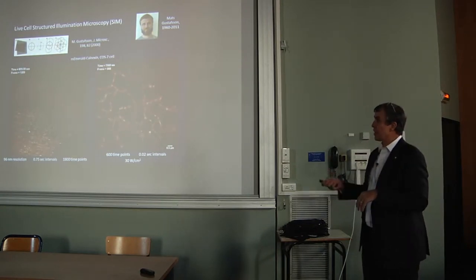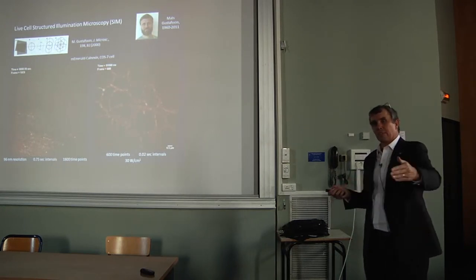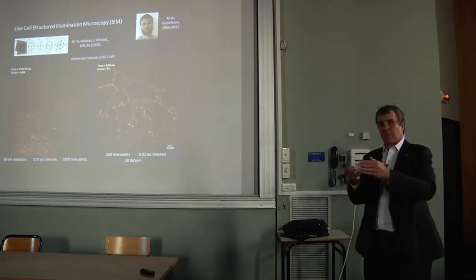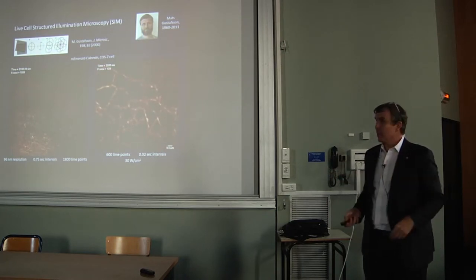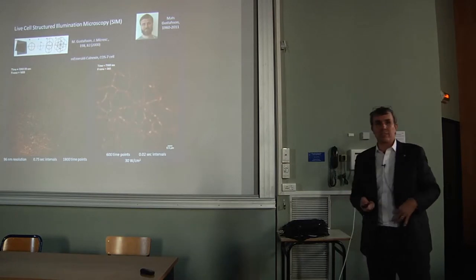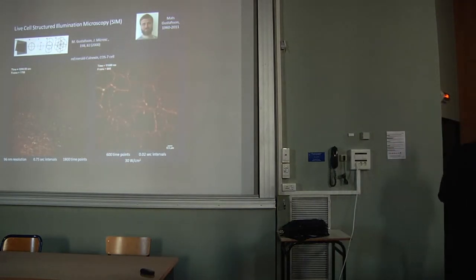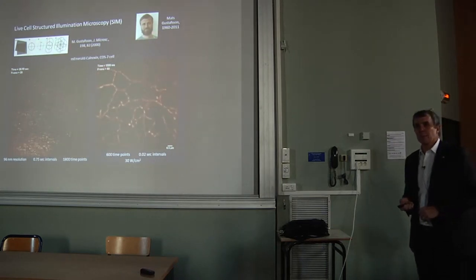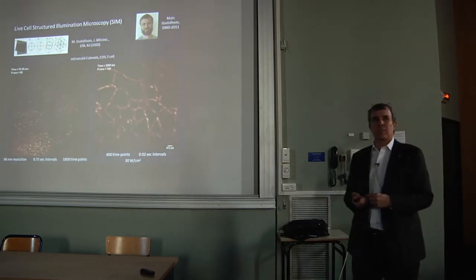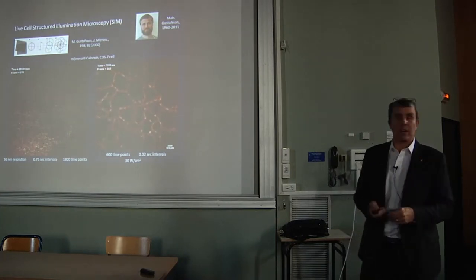By doing that, and that sort of demodulation approach, you're able to extend the resolution by a factor of 2, because you can't write a finer grating than the diffraction limit itself. So that's one of the reasons the committee cited in not having SIM be part of that Nobel. But I actually think that's a mistake, because I think SIM will actually be the super resolution method that will end up contributing the most to biology.